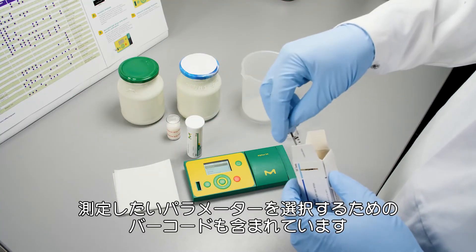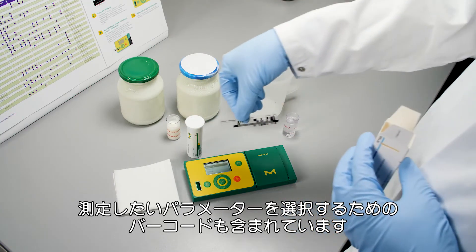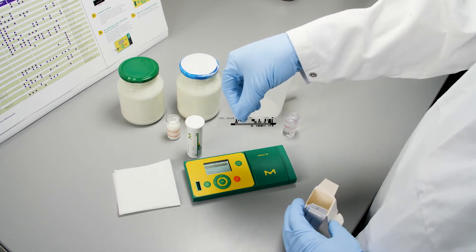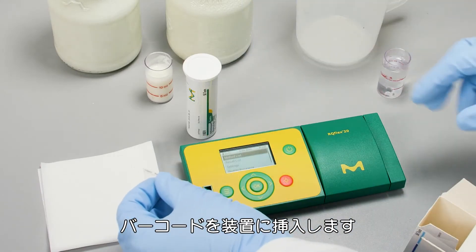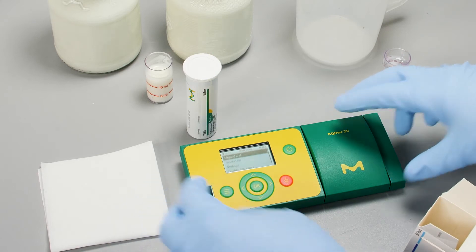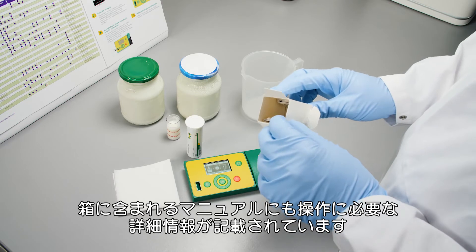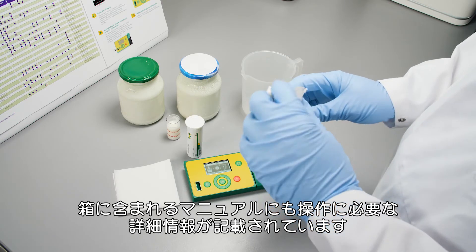We also have a barcode that tells the instrument which parameter you want to measure. We put the barcode into the instrument. Also included in the package is a manual that gives you more information about what you have to do.